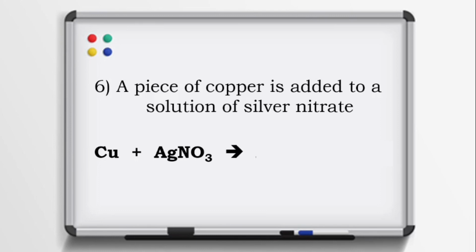So let's look at what we are starting with. With this element and compound, hopefully this is starting to seem like a single replacement reaction. Like maybe this single copper here is going to come over to this compound that thinks it's nice and stable and happy together, and then suddenly break up that nice, stable, happy compound so that it can be part of the compound and kick out another part. And that's exactly what's going to be happening here. So noticing what we're starting with and identifying the type of reaction is going to help us figure out what's happening here in that test tube.